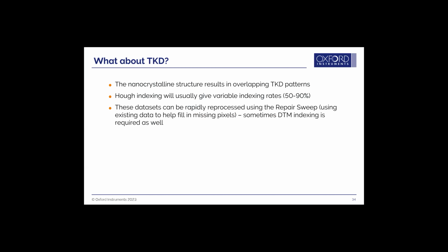What about TKD? You saw the impact diamond. That was a TKD sample, but the pattern distortion and the geometries are quite a bit different. I've gotten questions about whether it works for that as well, and the answer is yes. I've had Pat Trimby say the exact same thing to me that Ben reiterated: are you sure you have to do TKD? Perhaps there's a better way, but sometimes there is no better way. Usually it's a difficult sample, or a very fine resolution sample that you're looking at.